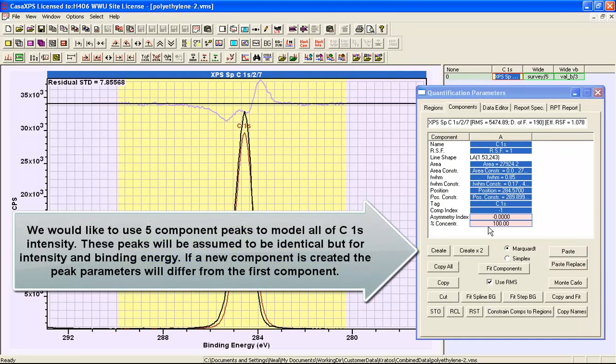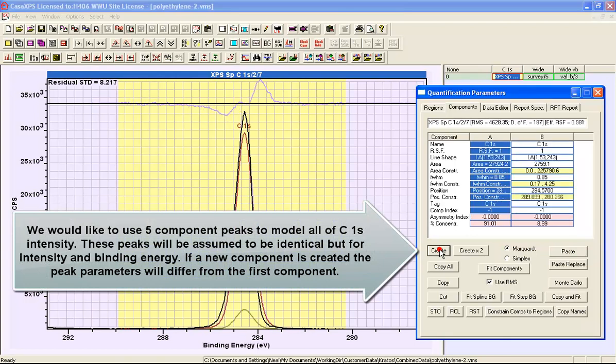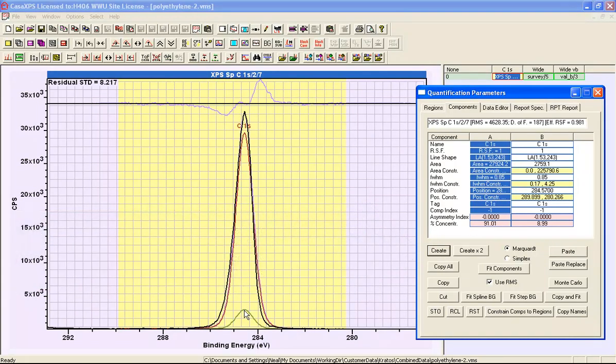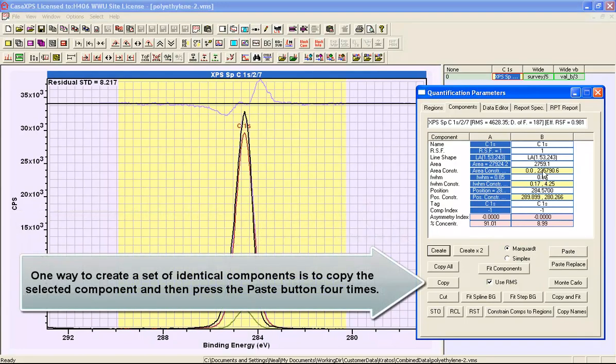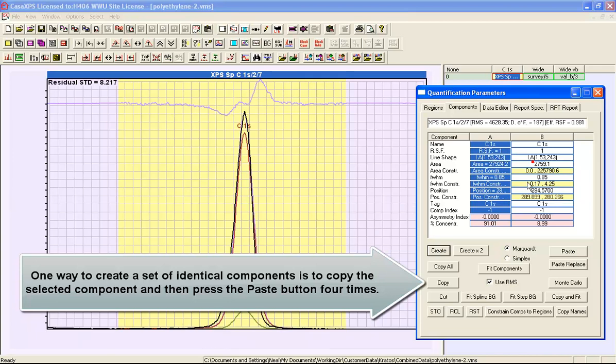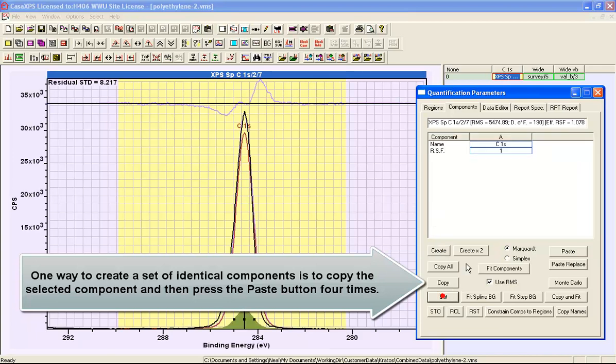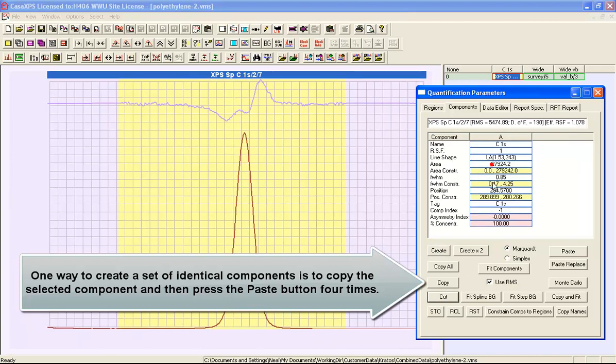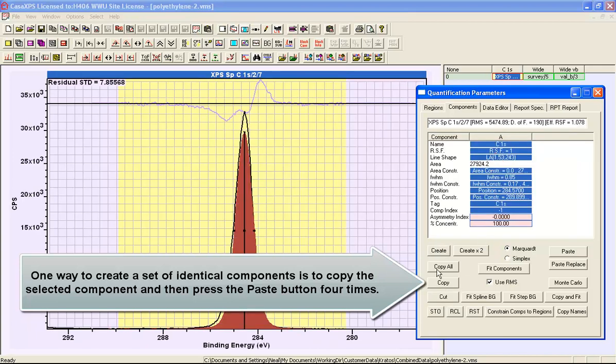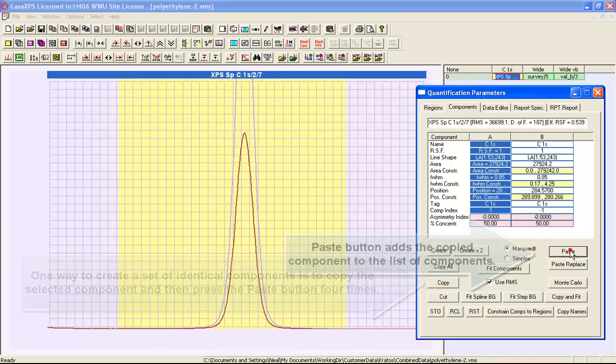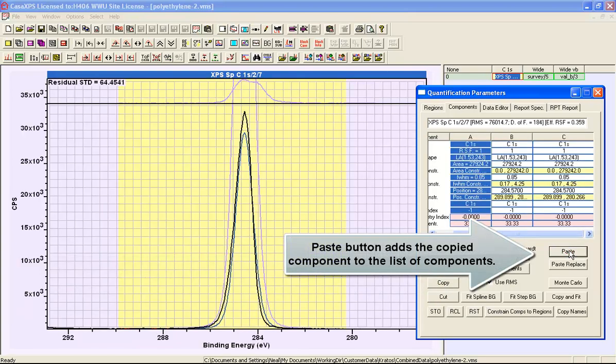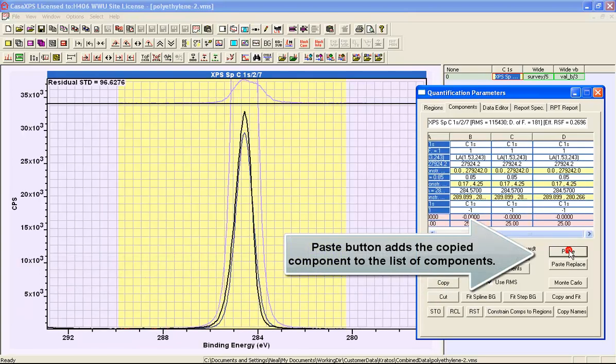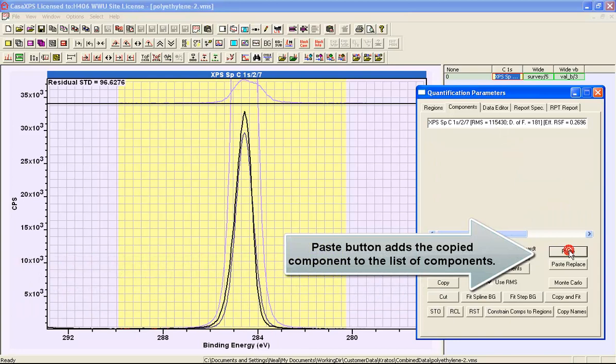If we were to just add more peaks, the idea would be that the peak would come in with its independent parameters of area, full width at half maximum, and position. But this is not what we're going to do. What we're going to do is create a copy of this peak and we're going to add five of these peaks.